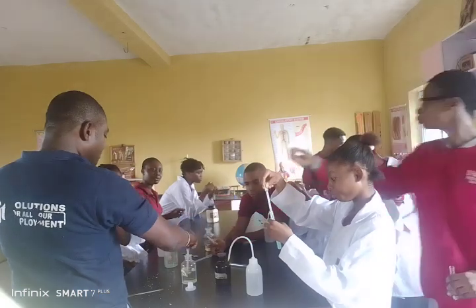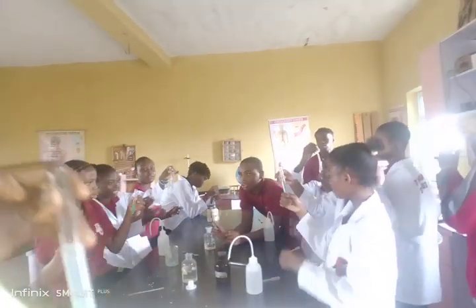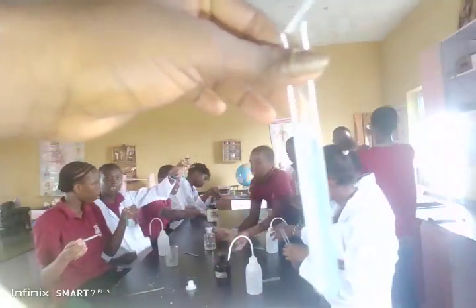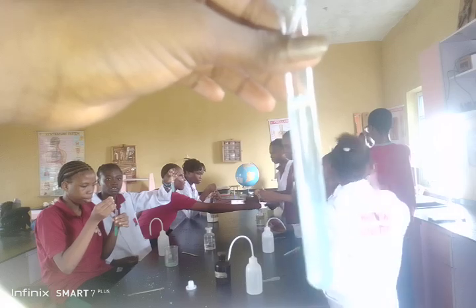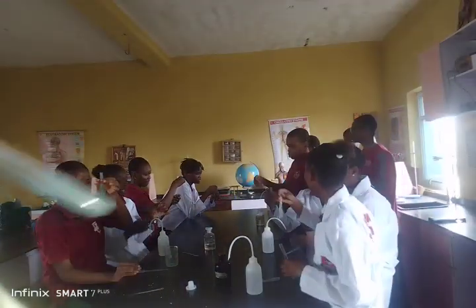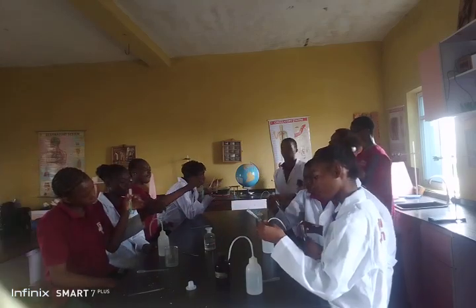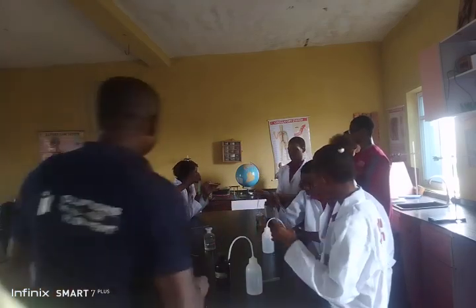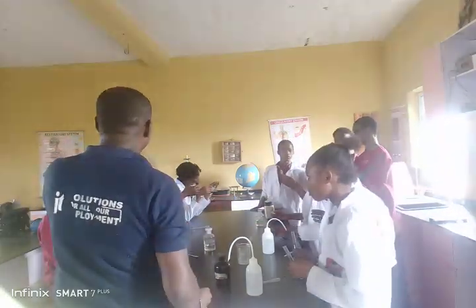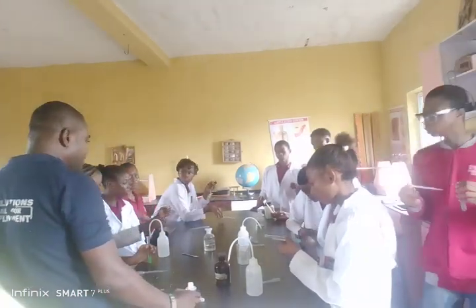What did you see? Any visible reaction? No visible reaction. You must not see anything. HNO3 must not give you any visible reaction. You only made the solution clearer somehow, but it will come back. There's no visible reaction. But they can ask in the exam: if you know that there will be no visible reaction, then why are you adding HNO3? The answer is to prevent the precipitation of foreign ions. That's why you are doing that.